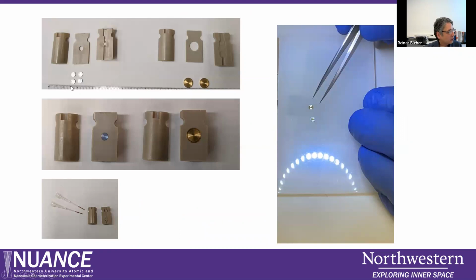So this slide shows again how the whole assembly is formed. We have the carriers that contain the sample, we have a mid plate here, and we have the two cartridges. Usually a sandwich is formed with the two carriers. It's placed in the mid plate, and this mid plate is then placed on top of a cartridge half, as we see here, and then the other cartridge is placed on top for freezing. For the copper capillaries, we have special cartridges in which the copper capillary is placed.